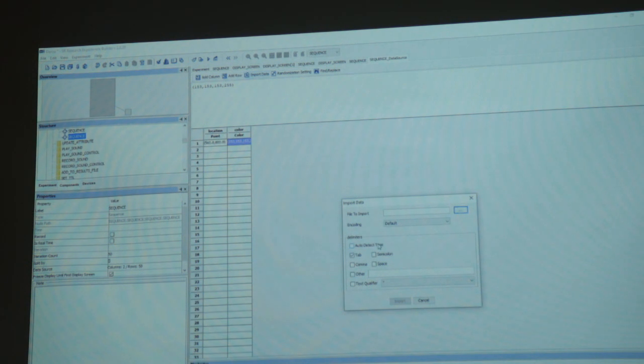If you're using an Excel file and you've kept tab, and when you're making these columns, let's say you have named one column location of target, it might take location as one column, of as one column, and target as one column. You don't want that. So if you want a multiple word name, use underscores to connect them, so you don't have any tabs.